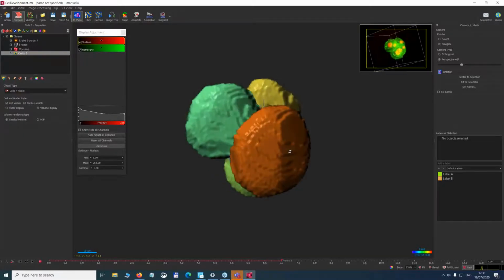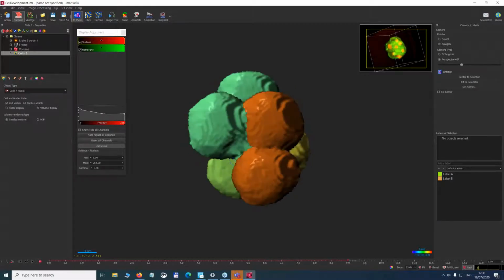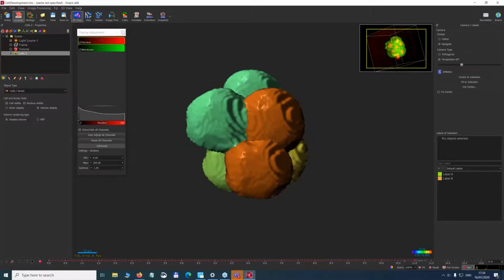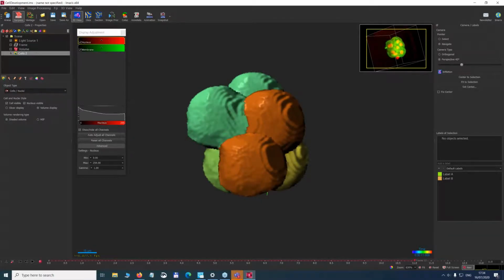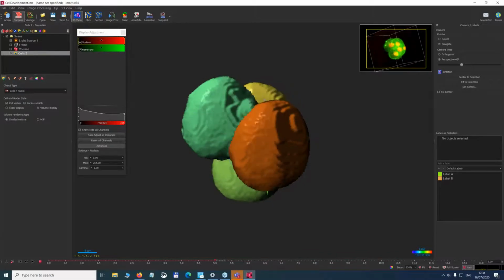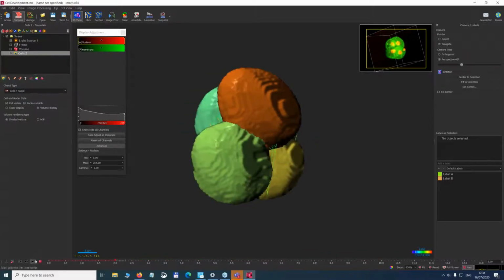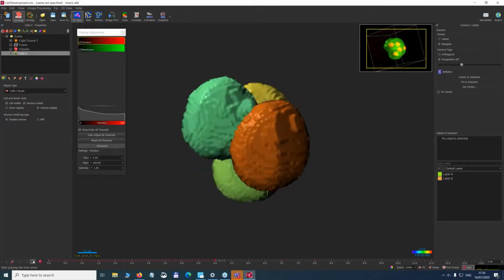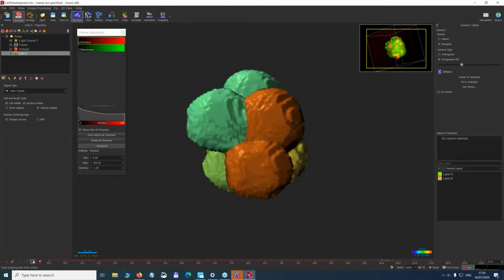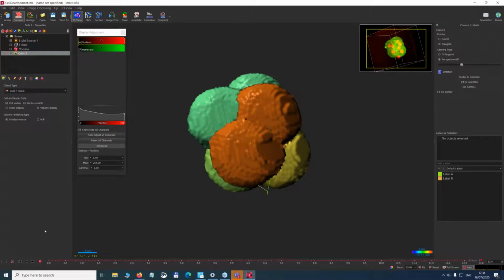This is probably not the best answer, but it's the one that we're often choosing when we do have this type of data where we're segmenting them as membranes. And yes, so we've got more information that we're delivering to the tracking algorithm in this case, and so it helps you get better results. Let's see. We have lots of questions coming in at the end.